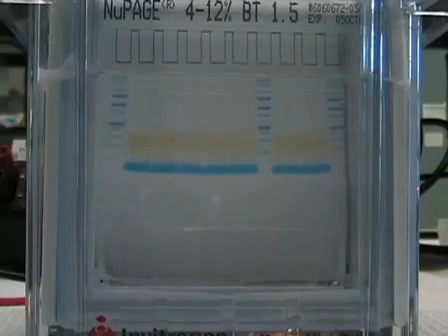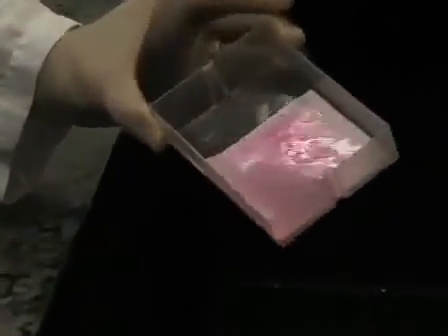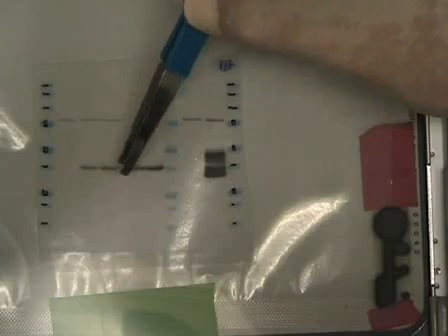This is a basic technique to analyze the expression of protein or to check the results of a co-immunoprecipitation experiment. The Western blot technique involves three basic steps: loading and running the gel, transferring the protein from the gel into a nitrocellulose membrane, and immunoprobing the membrane.